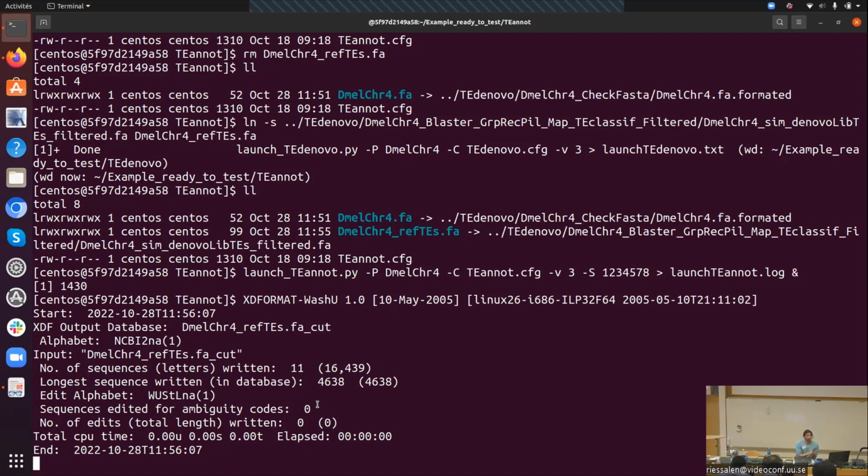And that's it. If there are a few questions, maybe we have a bit of time. Then, what size is considered a fat genome for REPET? In fact, this question really depends on the computational resources you have. A fat genome could be launched without doing a subset, but if you haven't got high computational resources, that's going to be hard.